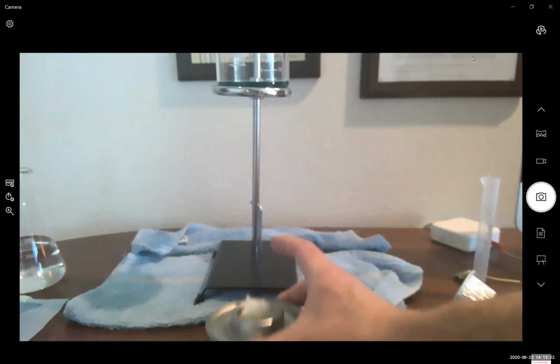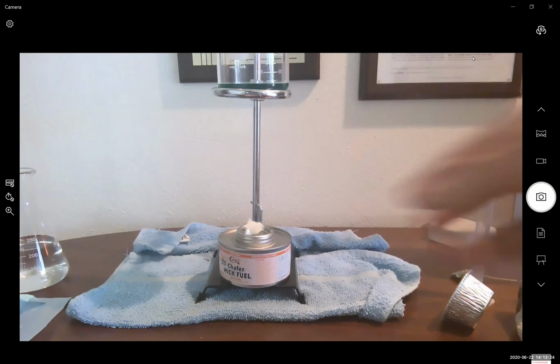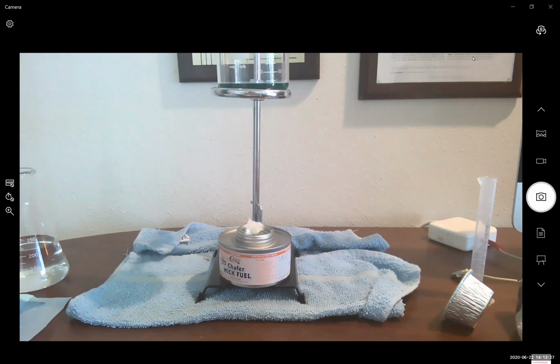Okay, so we're going to place our sterno can on our stand, and then we can light with the matches provided in the lab kit. We don't even have to use our spatula to open it, as it's a wick fuel. Depending on the brand of sterno container in your lab kit, there may be a slightly different opening and lighting procedure.